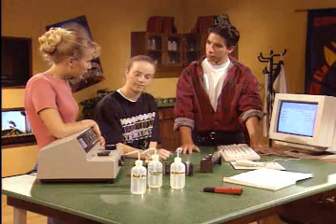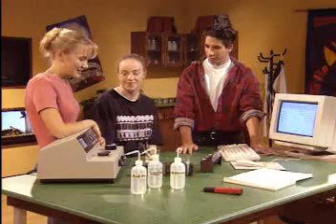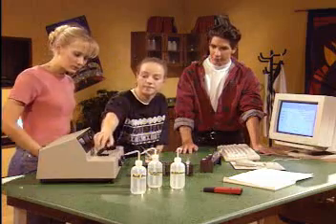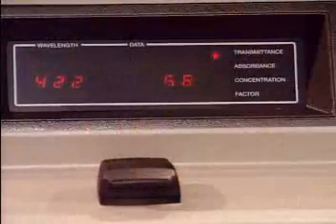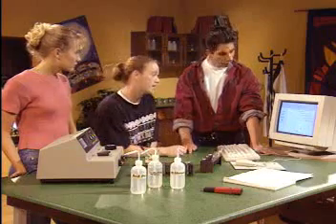And what did you measure and record? Oh, it was really neat. I used the spectrophotometer. A what? A spectrophotometer. It's used to measure the amount of light that passes through a solution in a test tube. The greater the amount of yeast that's growing, the less light will pass through. I recorded the results every 15 minutes and compared them with the standard. And that's what we have here.